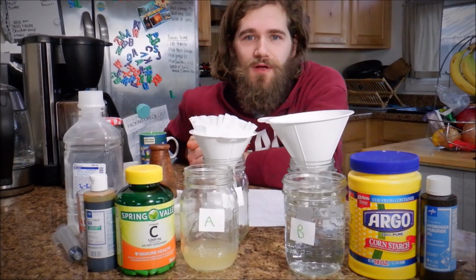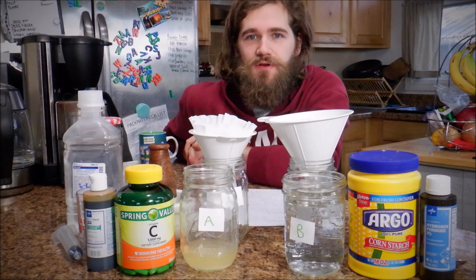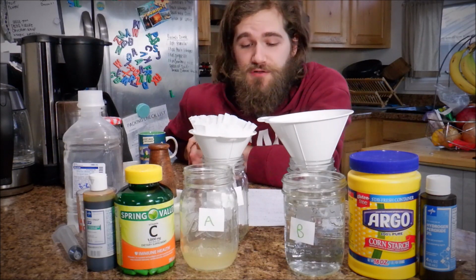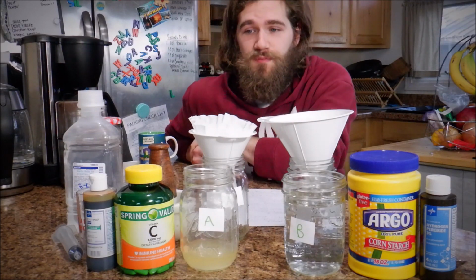Hi, my name is Alec Goulet, and today we are doing the iodine clock reaction for General Chemistry 2 at Duane University. So, what we're looking at with the iodine clock reaction is we have some simple ingredients.